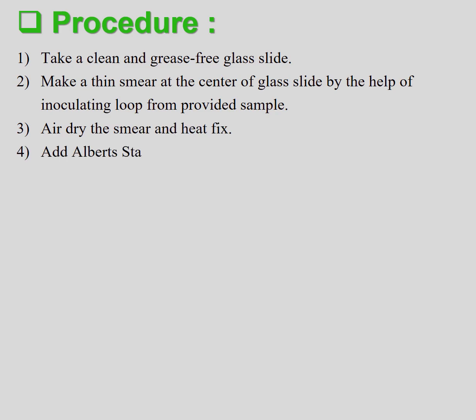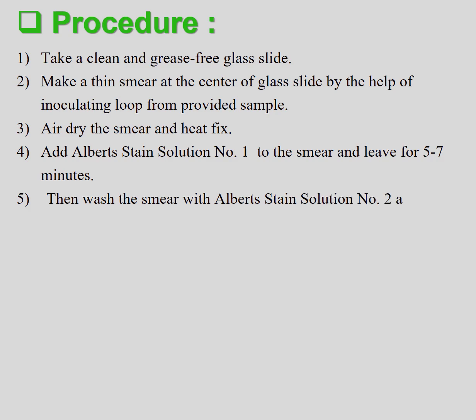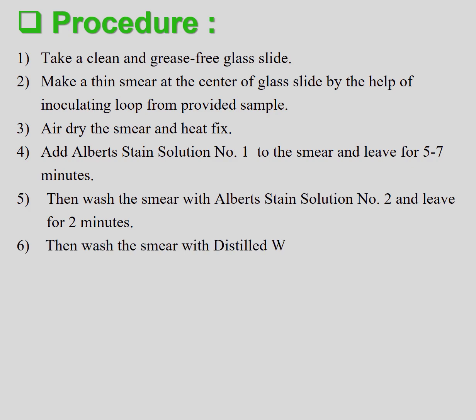Add Albert's Stained Solution No. 1 to the smear and leave for 5 to 7 minutes. Then wash the smear with Albert's Stained Solution No. 2 and leave for 2 minutes. Then wash the smear with distilled water or tap water.